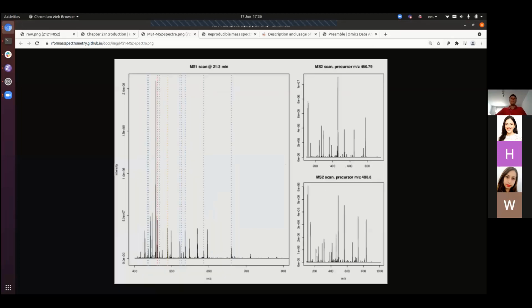Thank you. So the ions of this red peak are broken into pieces, and the fragments are now separated to produce another scan, but this one is called an MS2 scan. Here we have an MS1 scan where we separate the peptides, and then individual peptides are selected and broken into pieces to produce another scan, but this time it's a second level scan, so it's called an MS2 or MSMS scan. All these peaks are the result of breaking the initial peptide into pieces.